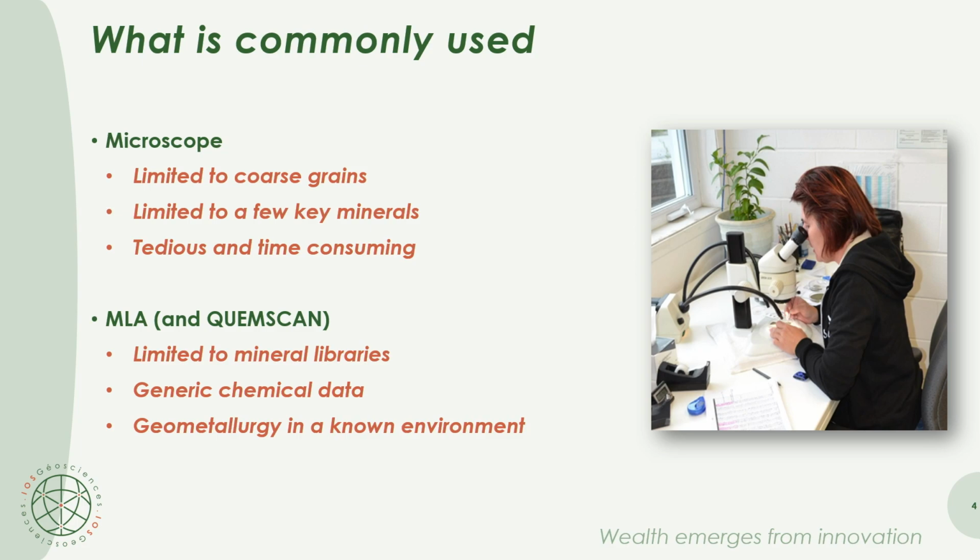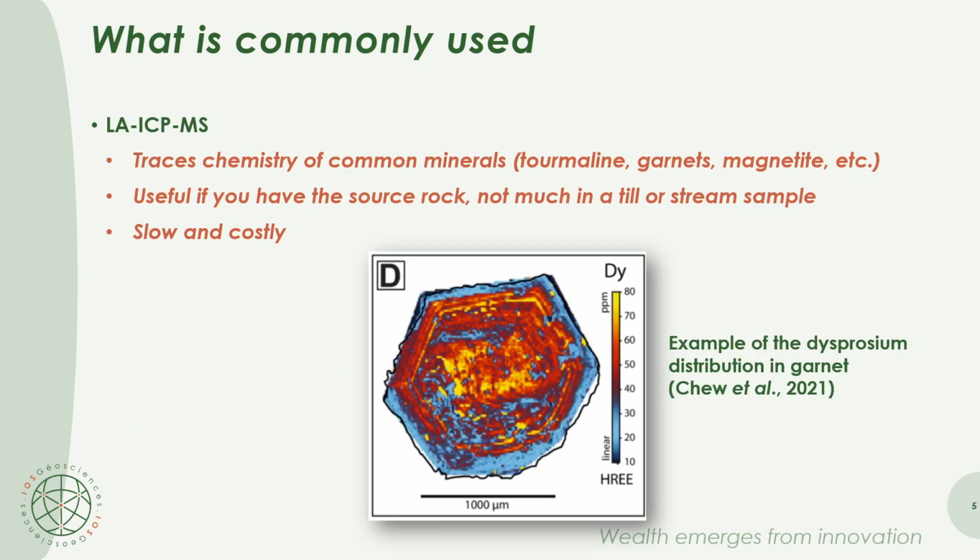I'm too short, I don't see the screen in front of me. But MLA can be useful for geometallurgy in a known environment, so you know what to expect. So it could be useful in those circumstances.